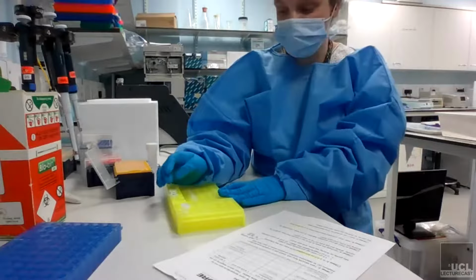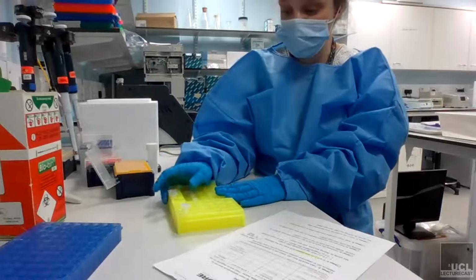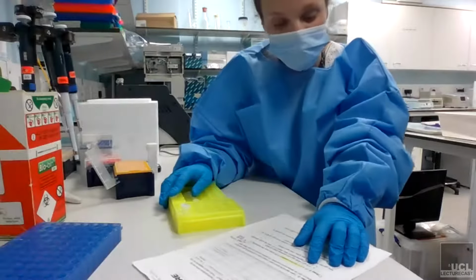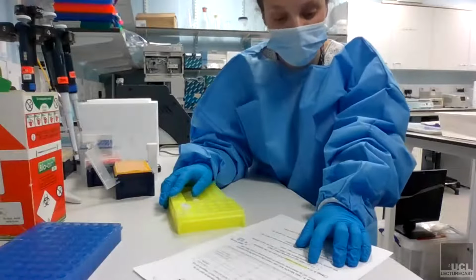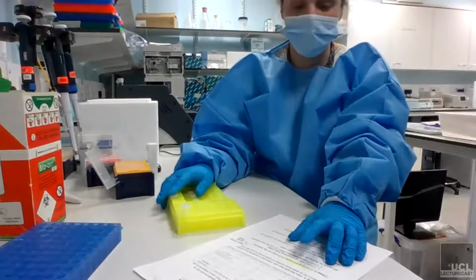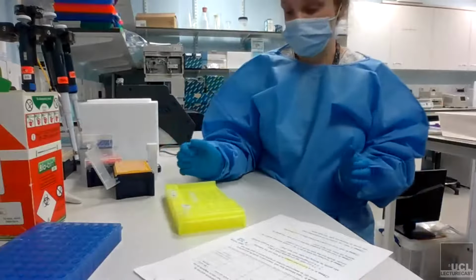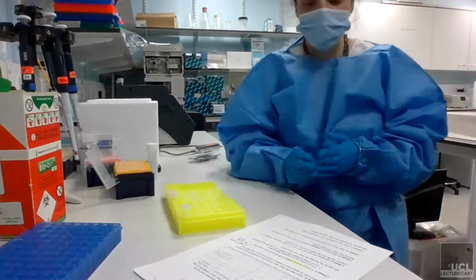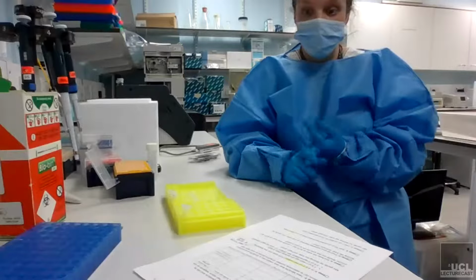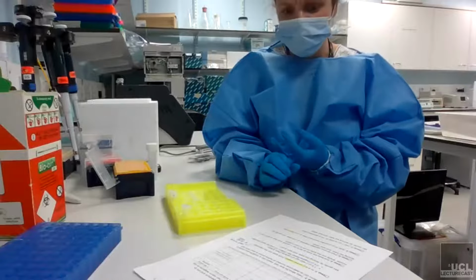Once you've extracted, it doesn't matter necessarily what extraction protocol you've used, as long as you can get the right size and quantity. What Nanopore suggests you need is 7.5 microliters of DNA, and it needs to be about 400 nanograms. So that works out to be about 53.3 nanograms per microliter of DNA. That's what you need to be aiming for. You can test that using the NanoDrop, the Qubit, or something like the TapeStation or the Bioanalyzer.